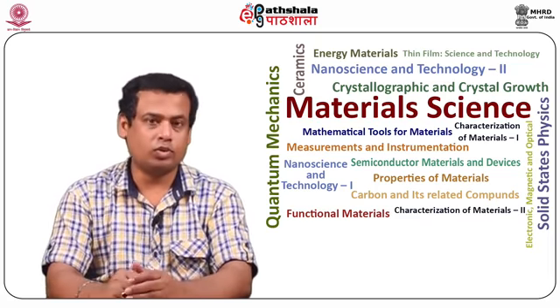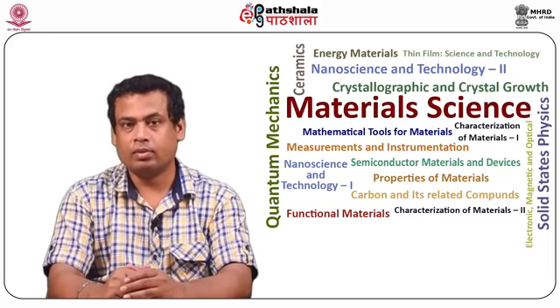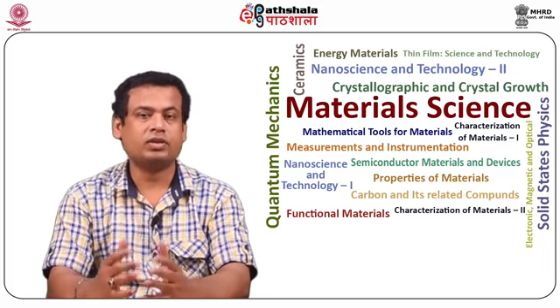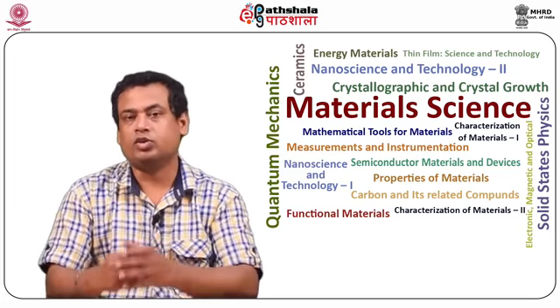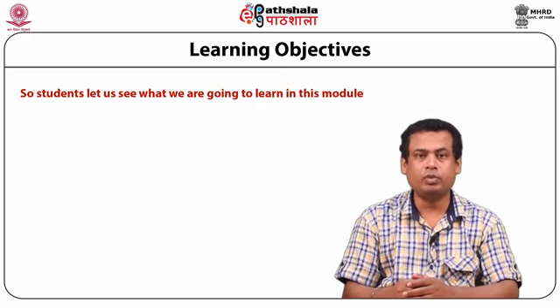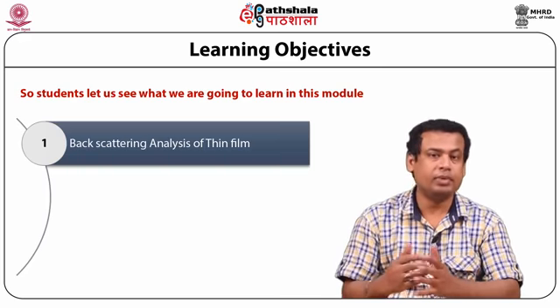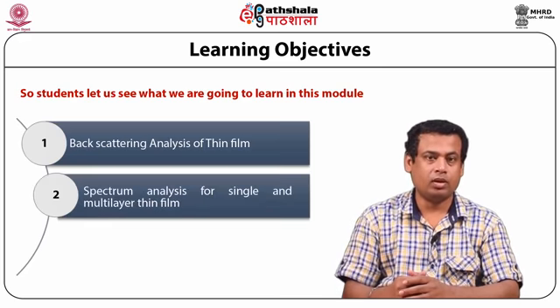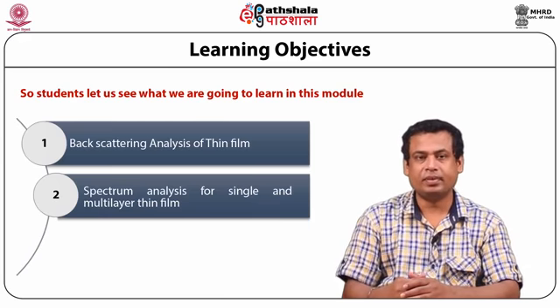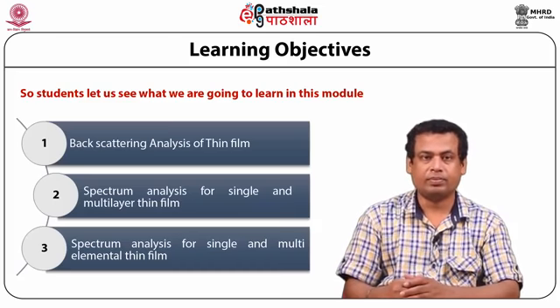Today we are going to talk on the module Rutherford backscattering part 4, which is under the paper Characterization Techniques for Materials part 2. After completing this module, the students will be able to understand backscattering for thin film analysis, single and multiple component thin film analysis, and single and multi-layer thin film analysis.